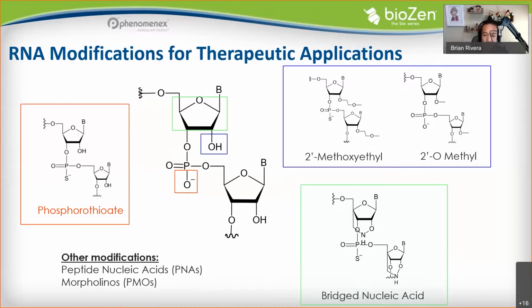And as this has, of course, been reported a number of times, that's 2 to the N isomers, where N is the number of thioate linkages. And of course, more important in today's discussion is the introduction of those diastereomers will create some peak broadening by chromatographic separation. And this, of course, will compromise the chromatographic performance. And thus, when you're trying to identify some of those process-related impurities, it makes things very complicated, to say the least.